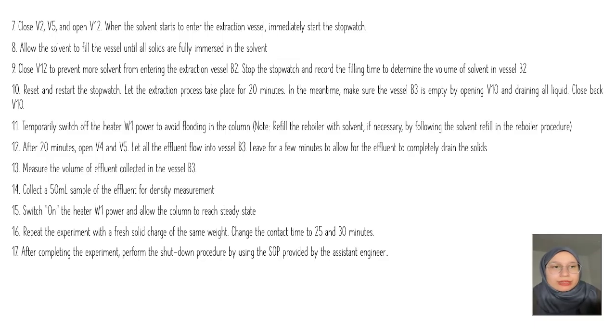Close V2, V5 and open V12. When the solvent starts to enter the extraction vessel, immediately start the stopwatch. Allow the solvent to fill the vessel until all solids are fully immersed in the solvent. Close V12 to prevent more solvent from entering the extraction vessel B2. Stop the stopwatch and record the filling time to determine the volume of solvent in the vessel. Reset and restart the stopwatch. Let the extraction process take place for 20 minutes.